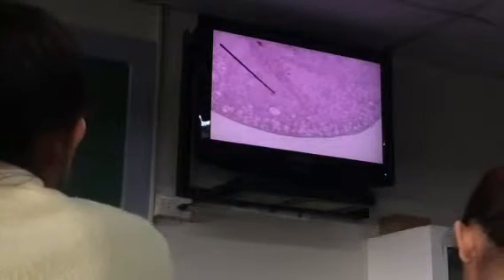Now, going back to scanner, I'd just like to identify again your corpus luteum. So, this is one, pero actually degenerating na to kasi meron na siyang mga bilog-bilog. No? That is one of the things I'd like to point out. Pagka meron ng ganyan mga round spaces within, it means it's already on the stage of degeneration. So this is the good one.